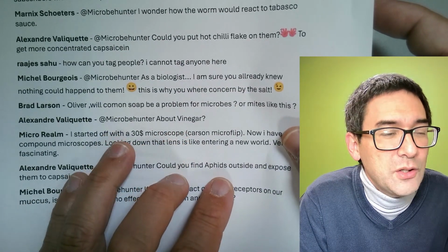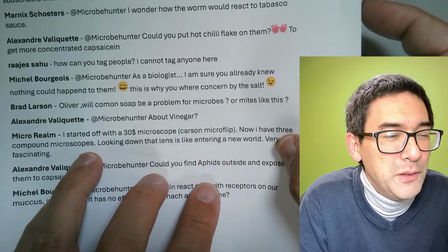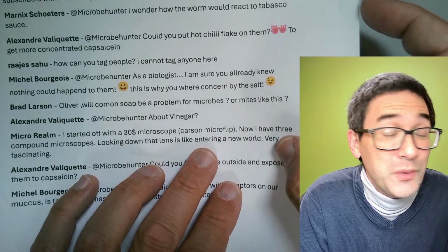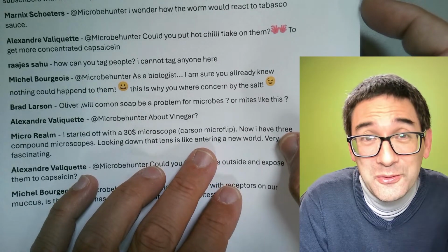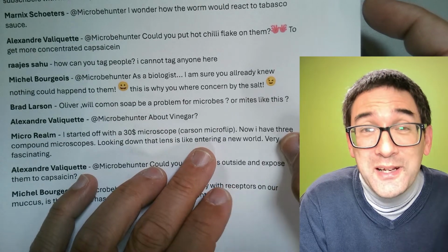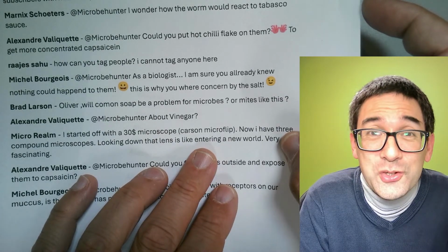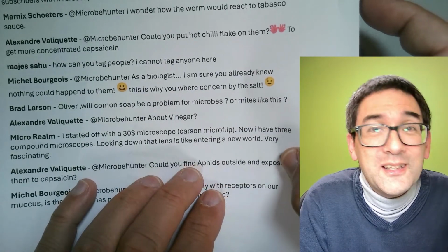Yeah, I started off with a $30 microscope. Okay, now I have 3 compound microscopes. Looking down at the lens is like entering a new world. Very fascinating. Yes, that's also one of the reasons why I like it. I like to explore things, and sometimes you simply don't know what to expect. So, for example, when I collected those water samples, I was rather surprised to find so many flatworms in the sample. Yeah, so it's something that I did not find before.